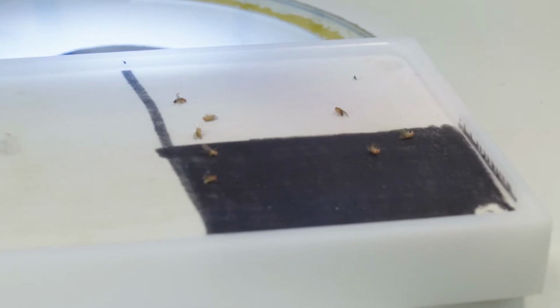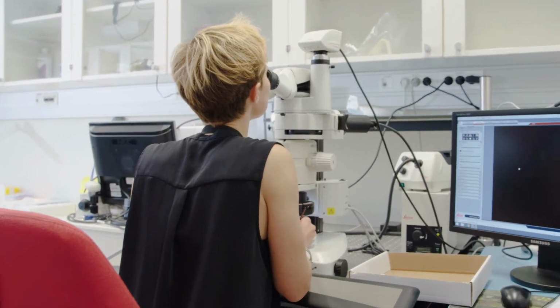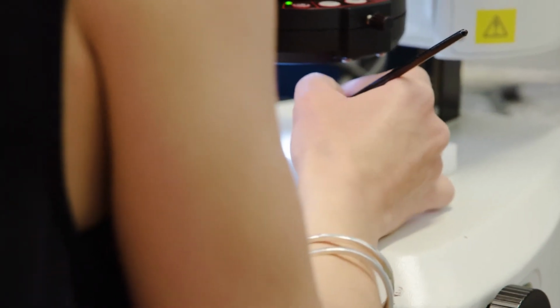So now we have males and females? Yeah, please. So we're going to have a look at them under the microscope, and it's very easy to see. And so I'm going to show you the differences.